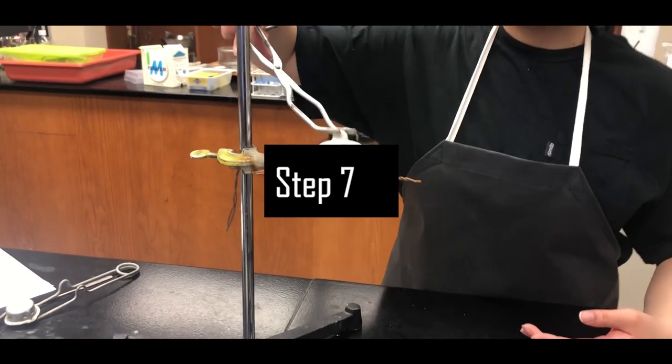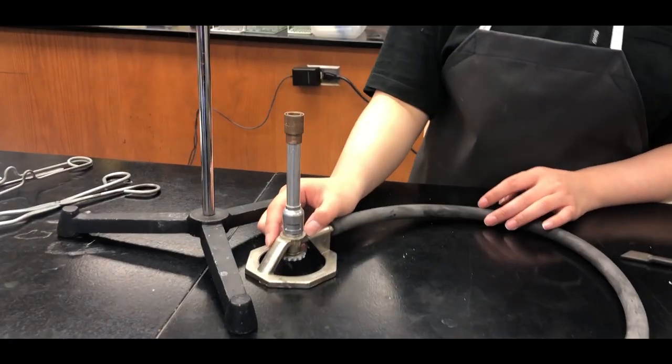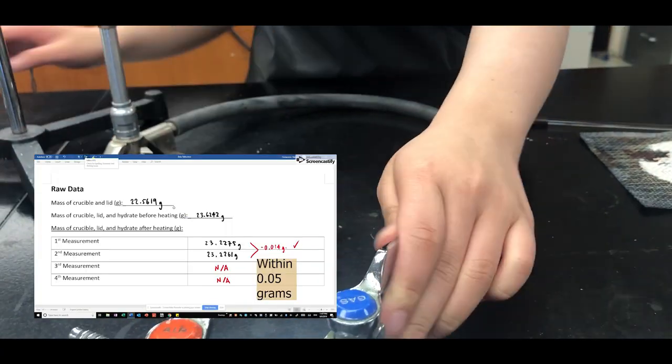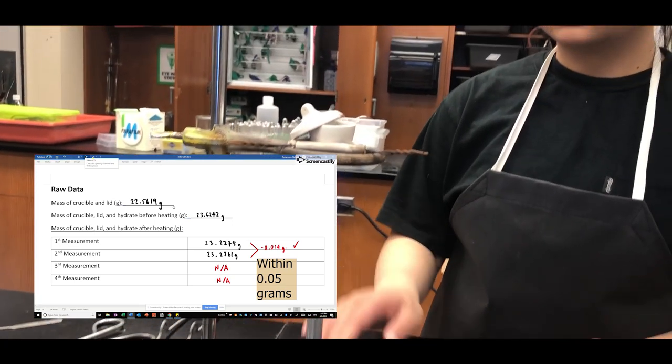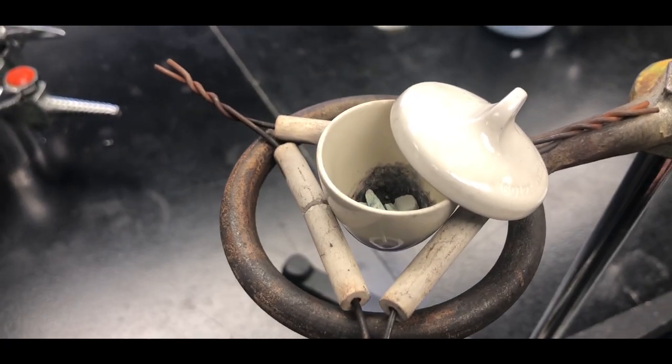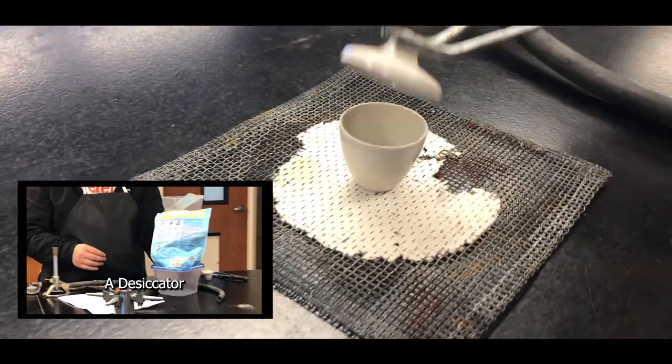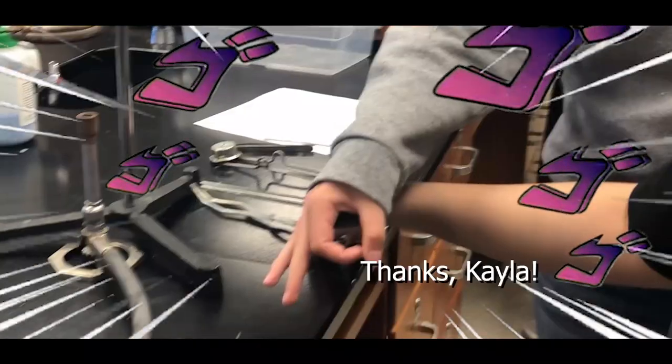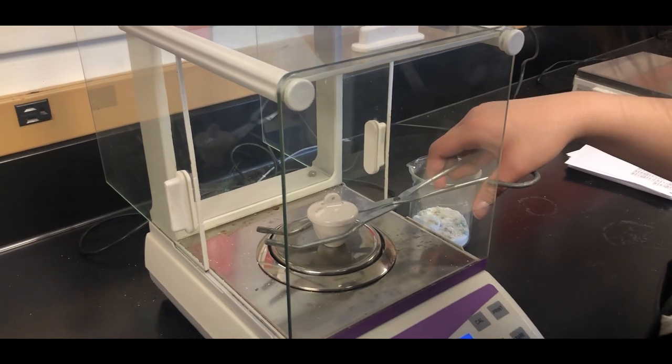Now, step 7. If the two mass measurements of the anhydrate are not within 0.05 grams of each other, repeat step 4 through 6. Place your crucible into a desiccator if the time constraints force you to complete this experiment on a second day.